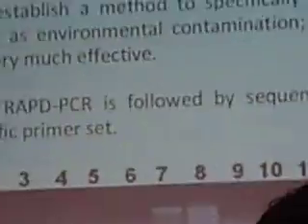Now here there is a RAPD pattern where the bands are developed. The first shows the band pattern of Bacillus anthracis and the second one shows that of Bacillus cereus. Results include the RAPD PCR fingerprinting, which is done using the RAPD PCR method with a random 10-mer primer. The RAPD PCR bands show that Bacillus anthracis-like members of Bacillus cereus produce fingerprints very similar to those of conventional Bacillus anthracis strains. These isolates may represent links between members of the group and a common ancestor.